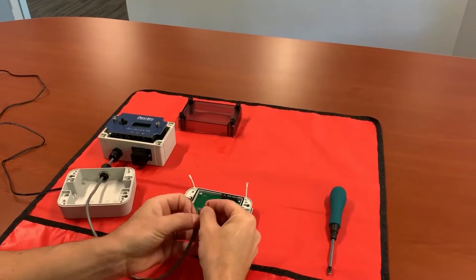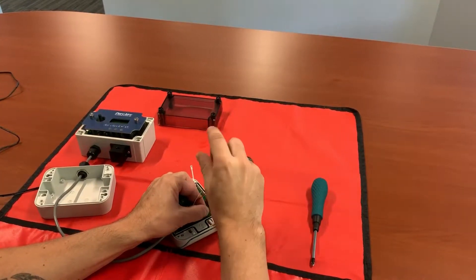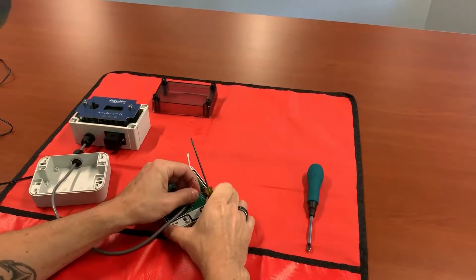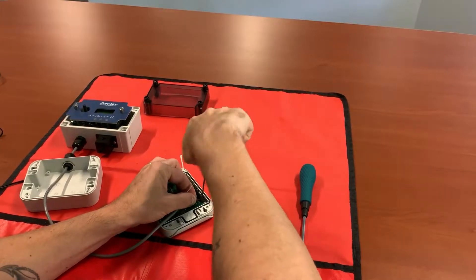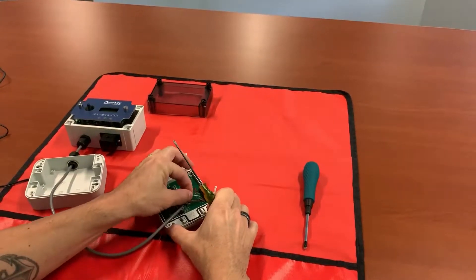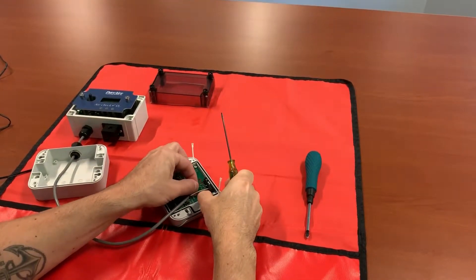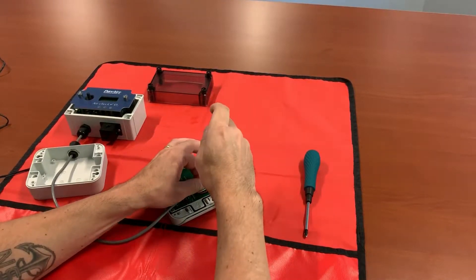Go ahead and connect up the ground first. As you do each one, just give it a little tug to make sure they're nice and tight. Milliamp signal is next, then we'll use our 24-volt. Last will be the shield — the shield will actually be used as the ground for the milliamp loop.